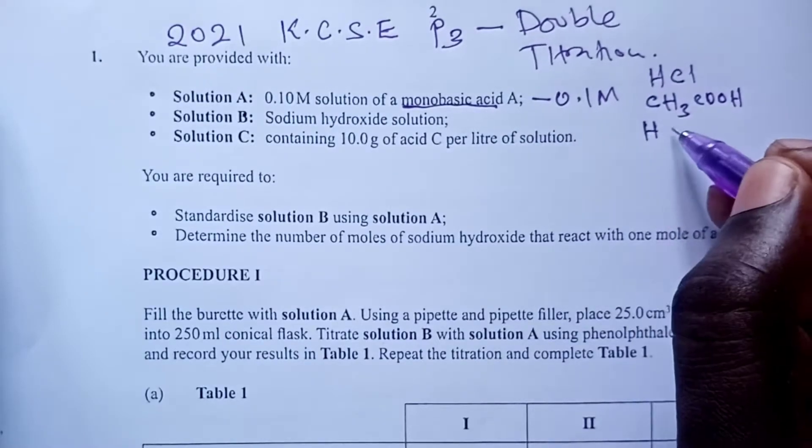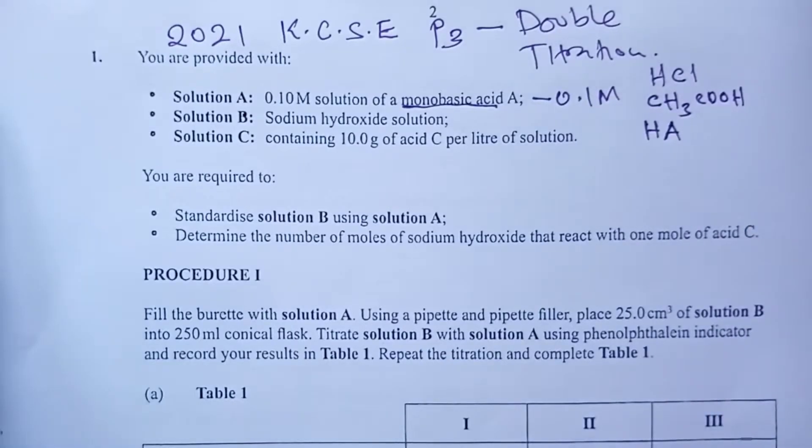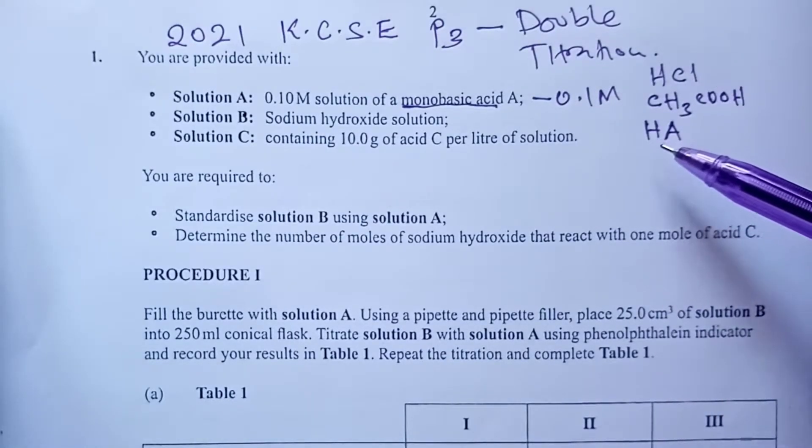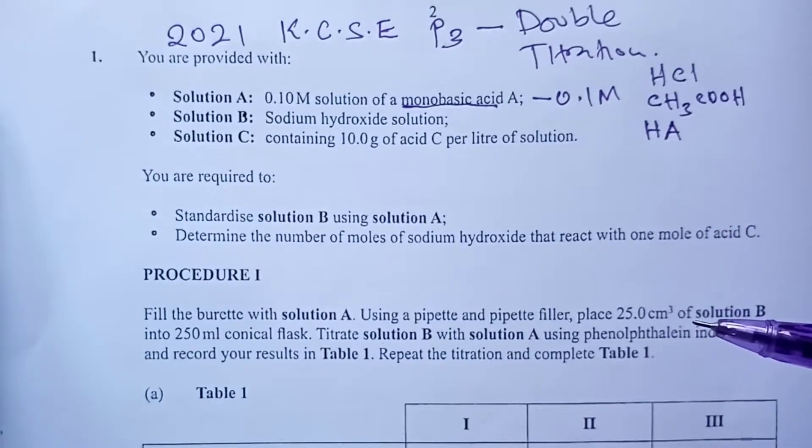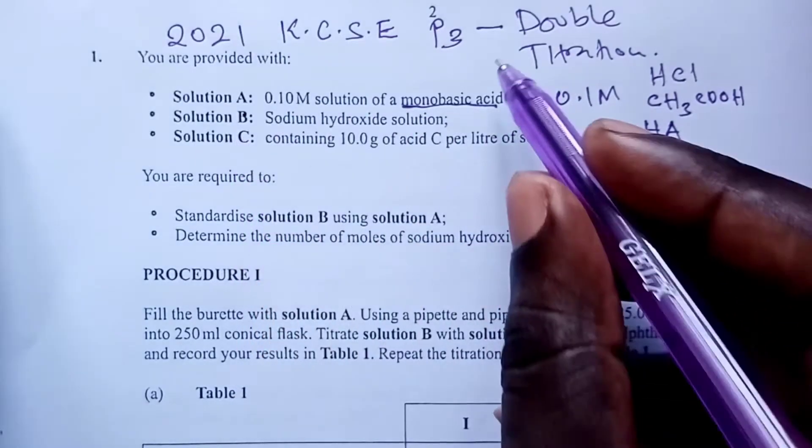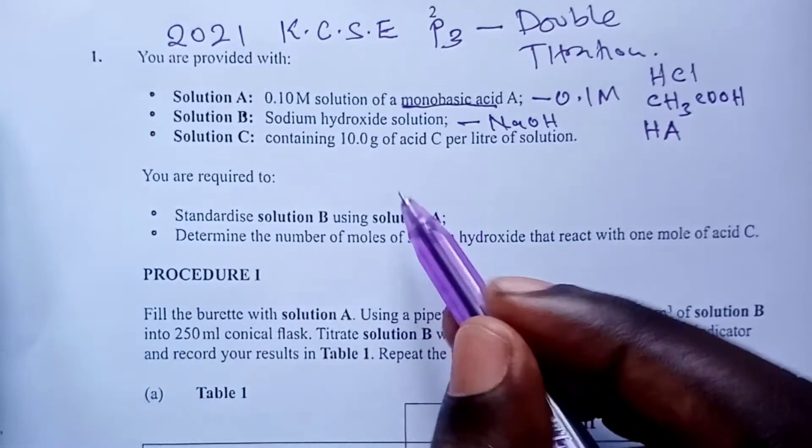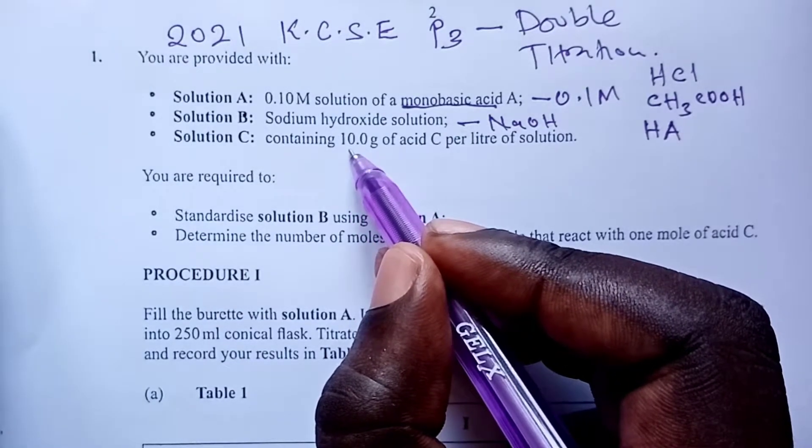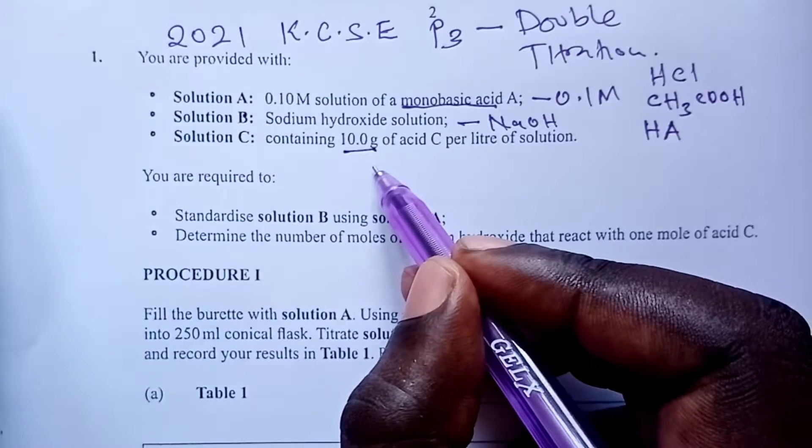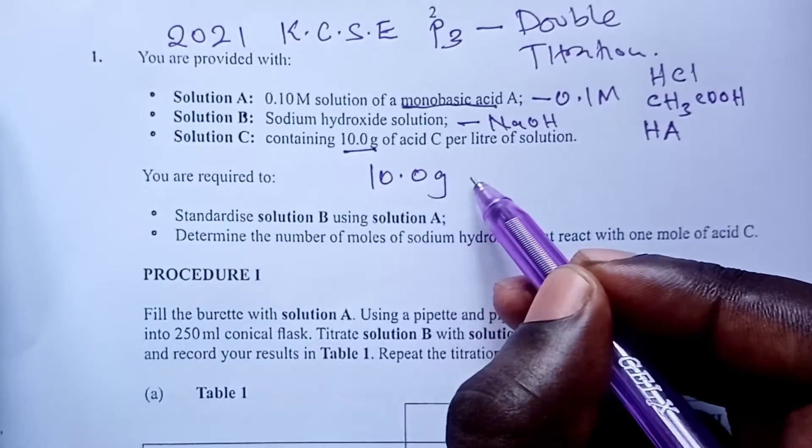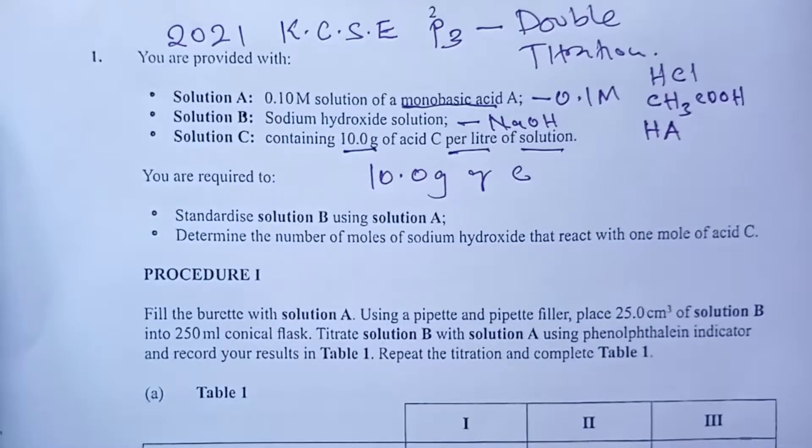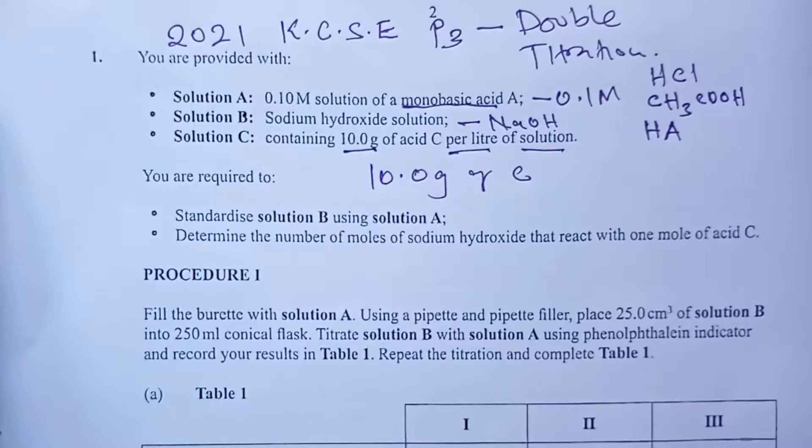Now, solution B is sodium hydroxide solution and solution C, we are told, contains 10 grams of an acid C per liter of solution. So we have done an analysis of the solution given.